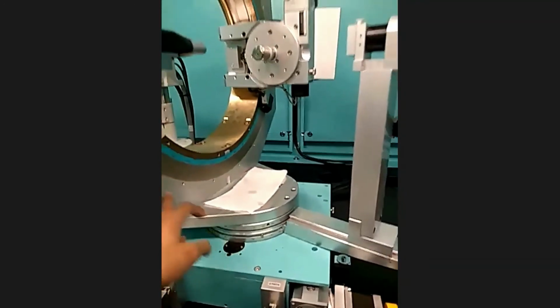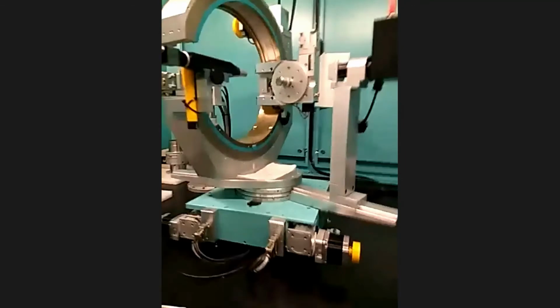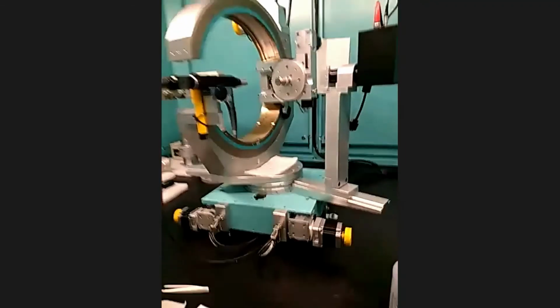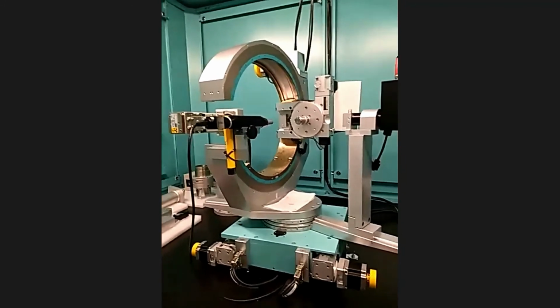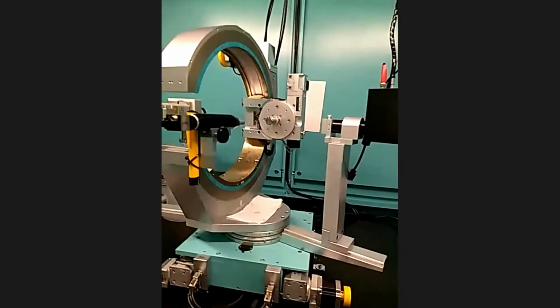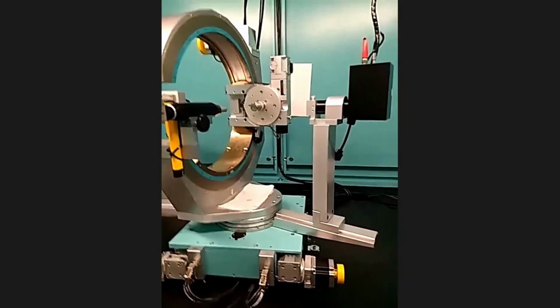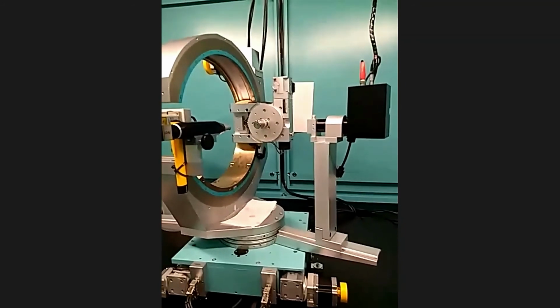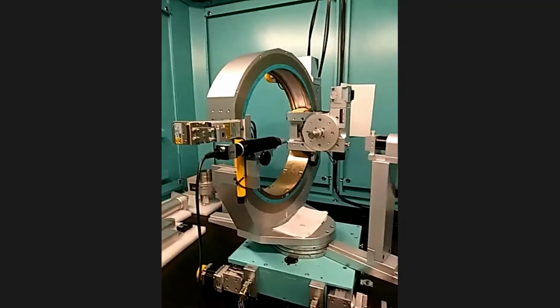So omega, chi, and theta, all three you can move and measure where the intensity goes after scattering. And once you map the whole angular area, you kind of know how it looks in reciprocal space.